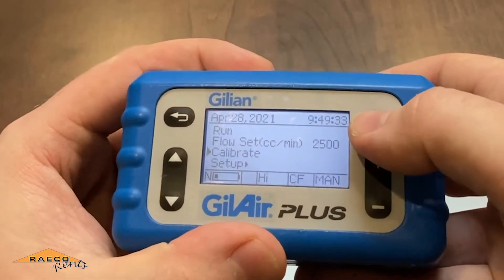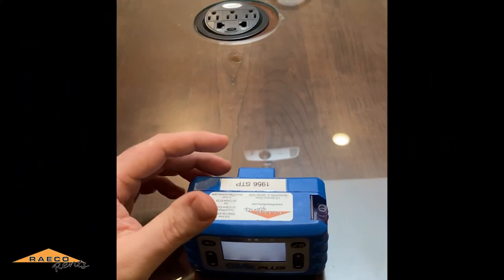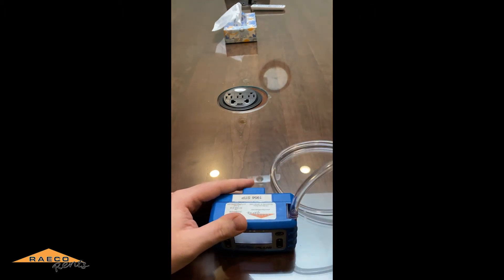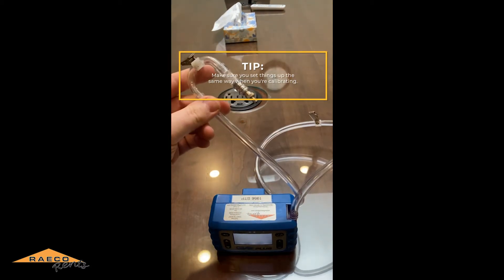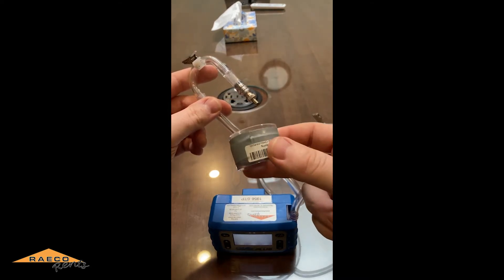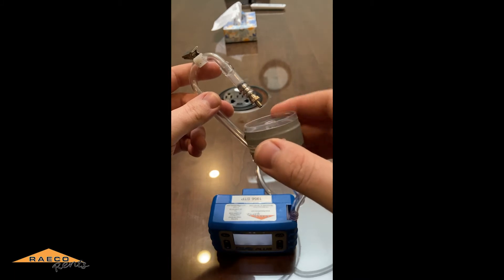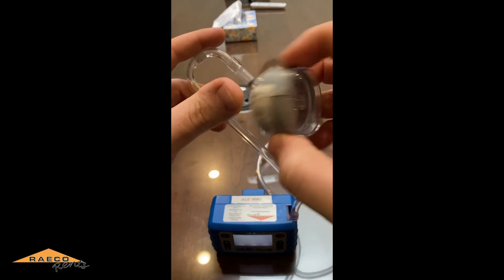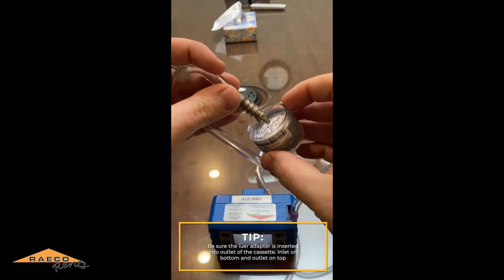Then we'll go to the calibrate menu and it will start running. We want to hook this up with our sample train — however you're going to be sampling with the employee, you want to set things up the same way when calibrating. Use a calibration cassette — the same type you use for sampling, but keep one dedicated only for calibration for all your pumps since it won't be a sample. Make sure the inlet is on the bottom and the outlet is on top.